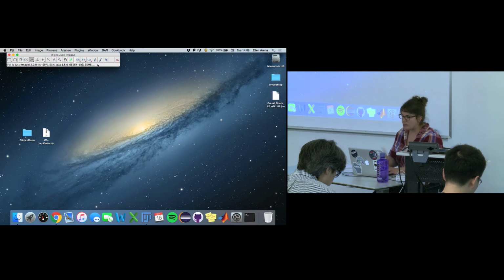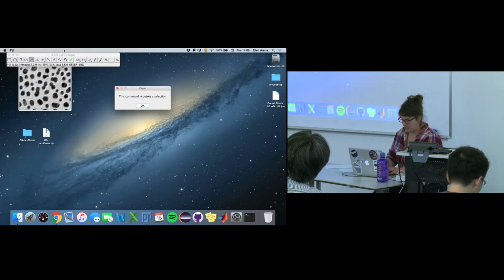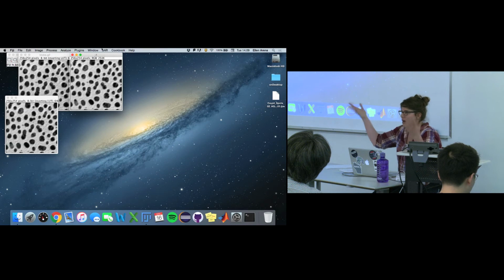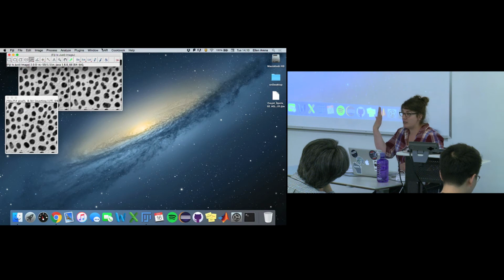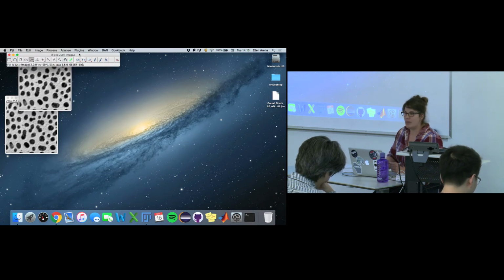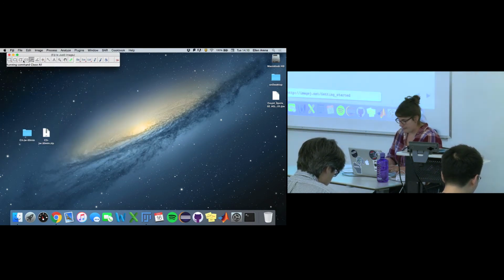So also, sometimes, for example, you're opening tons of images. Tons of images, right? And sometimes all these windows get popped up and you can't find your main window again. All you have to do is hit enter and it'll bring it right to the front, which can be handy. Instead of spending all this time moving windows around, you can just hit enter. Okay, and the main window comes right forward. Okay, so I'm just going to close all those.